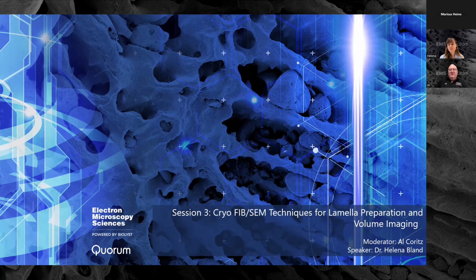In her role at Quorum Technologies, Helena delivers technical expertise and guidance to the company's global customer base, working closely with users to understand their specific workflow requirements and recommend tailored application-based solutions. Through her support, Helena helps customers optimize the performance of their systems, adapt to evolving scientific and technical needs, and achieve reliable, high-quality results in their work.